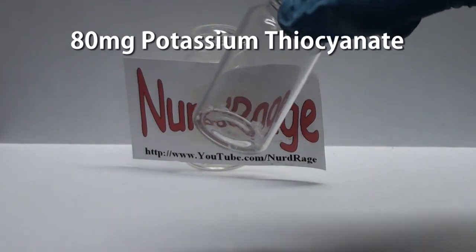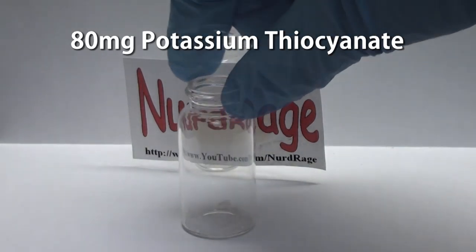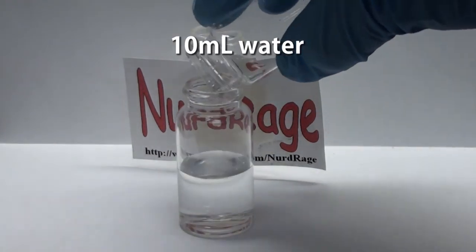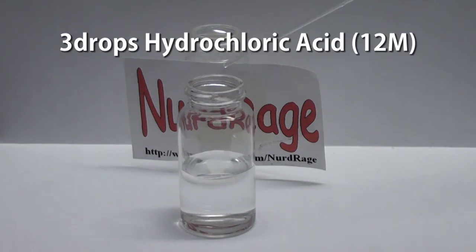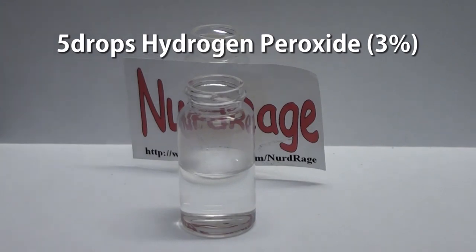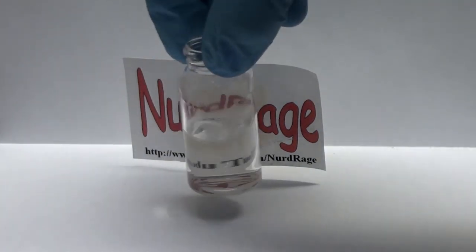First get about 80mg of potassium thiocyanate. Now add in 10mL of water, 3 drops of concentrated hydrochloric acid and 5 drops of 3% hydrogen peroxide. Shake up the mixture until completely dissolved.